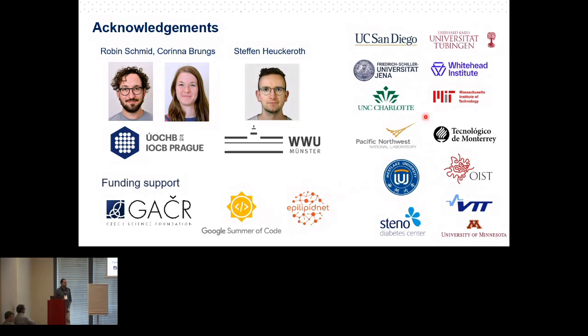That is true. If we have a database of these metaspectra, then maybe we need to adjust the search algorithm. We cannot use just the plain cosine similarity, but maybe something that's aware of the fact that we are working with these metaspectra. But I still think this is a rich representation, because different instruments are going to produce slightly different fragments. If we include all the possible fragments in that spectrum, we have the highest chance that we match something. And the same goes for computational methods like CSI:FingerID.